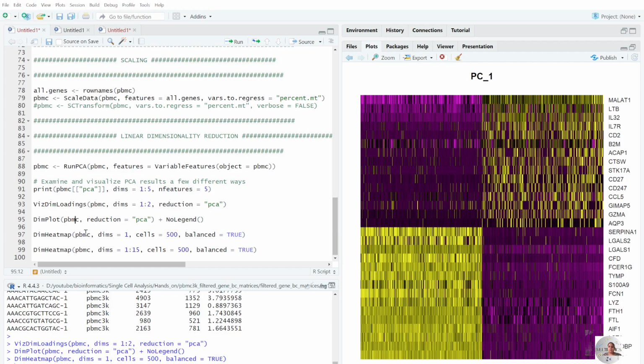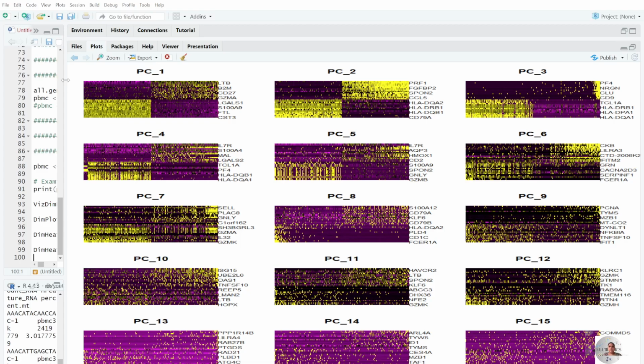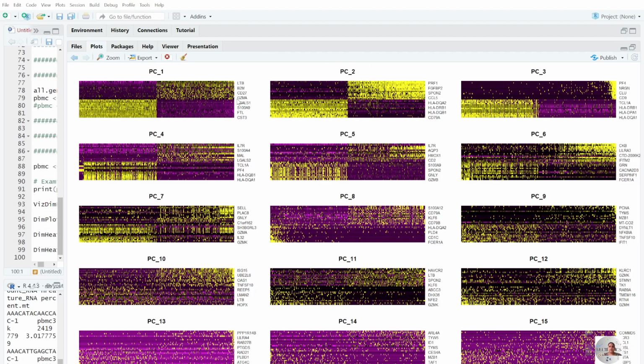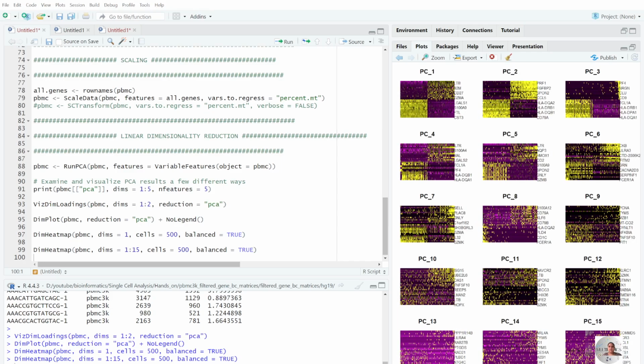So, moving on with the script, we'll again run this one. Right? Mm, no, this one we have already done. Now, this is the same as the previous code, but here, not only a single dimension, we are taking the first 15 principal components and we are running this over here. We'll get a plot where we can compare on the basis of different principal components. So you can see I've told you that PC1 is going to give us more variability. You can see so nicely that it has been clustered. But if you look at PC15, you are not getting any different clusters over here. So the variability decreases as the principal component increases, right? That is clearly visible over here.